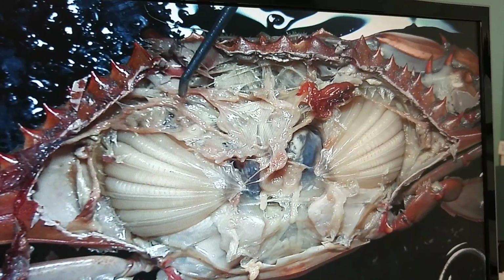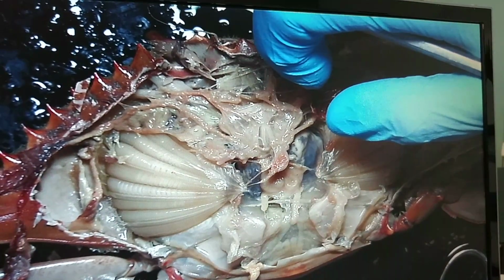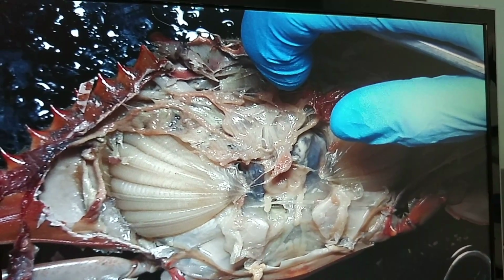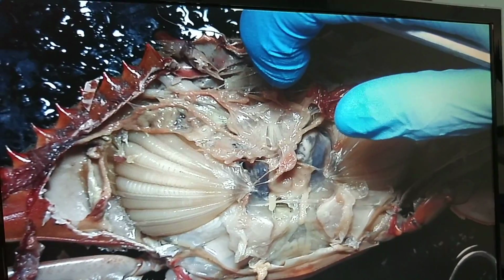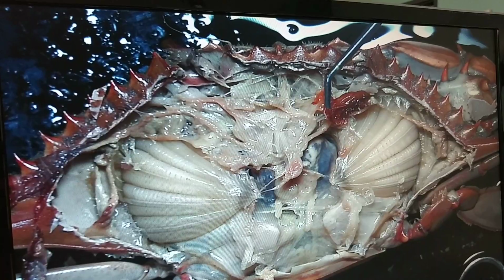What is hypodermis? You tell me. Break it down. What does hypo mean? Dermis is skin. Hypo is less than, below. Below skin. Exo. Okay.